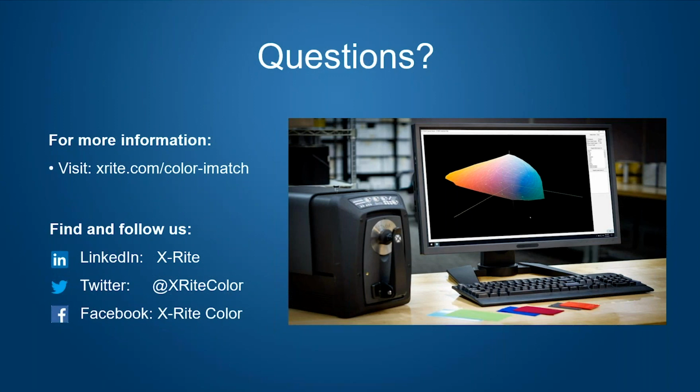Can wood stains and effect coatings be formulated? Those are two interesting things. Wood stains, yes, that's something we have successfully color matched with our multiflux engine. In terms of effect, I think the issue there is what type of effect it is. If it's an effect that would require something like a multi-angle instrument to measure, like automotive coatings, the answer there is no. That's a different product that we're developing.